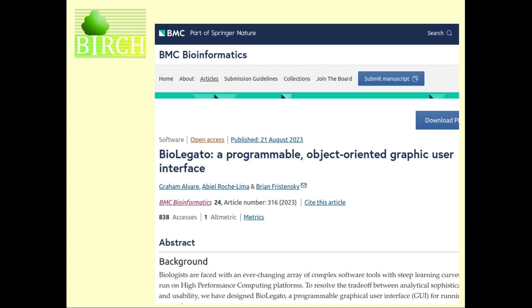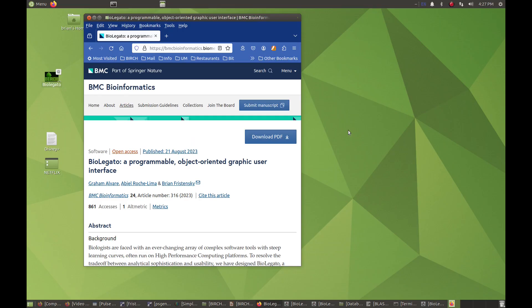For each type of data, there is a corresponding BioLegato application. BioLegato is programmable because when you launch BioLegato, it will read instructions in a small language that we've created called PCD that give you all of the menus and the ability to run programs that might be on the system.